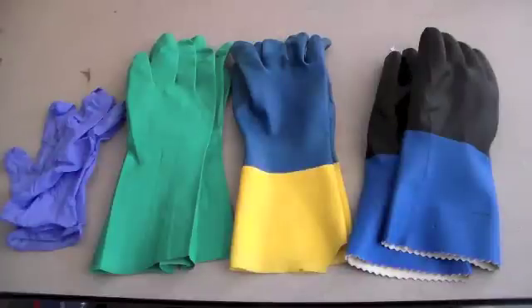Hey guys, and welcome to The Shack. Today I want to talk about one of the important pieces of information that I learned from the Flint Scientific Safety Course, and that involved glove safety.